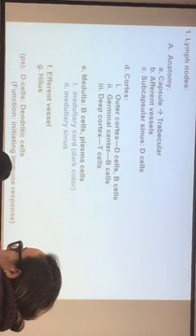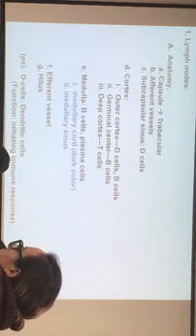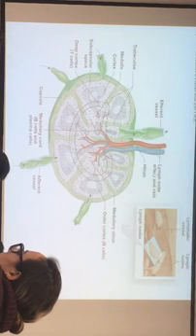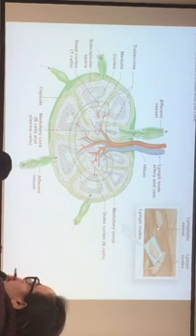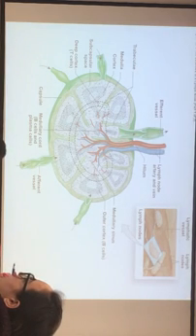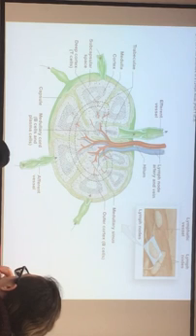Now we move to the organs. The first one is lymph nodes. Lymph nodes have an outside cortex and an inside medulla, and outside the cortex there is a capsule. I'll give you one look here. Next one is lymph nodes. We can see lymph nodes without a microscope. This entrance here we call the hilum. That's where the blood vessels and lymphatic vessels move in and out.